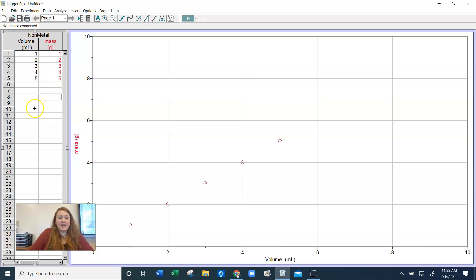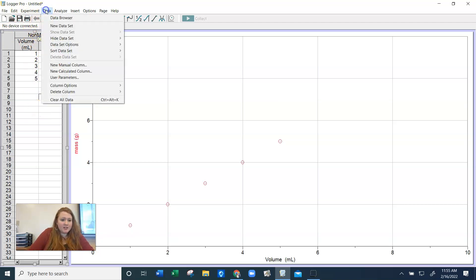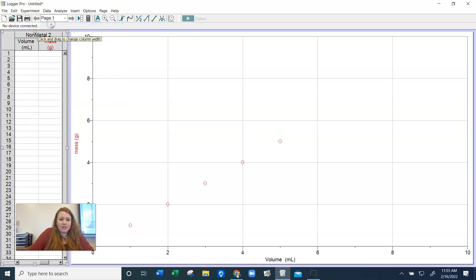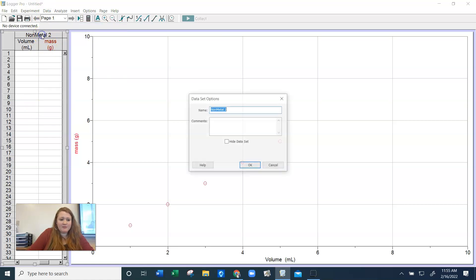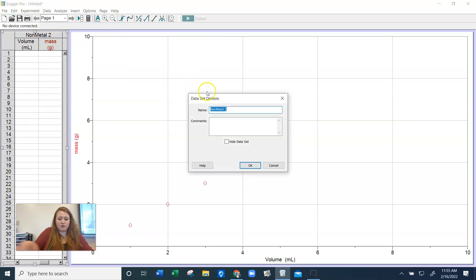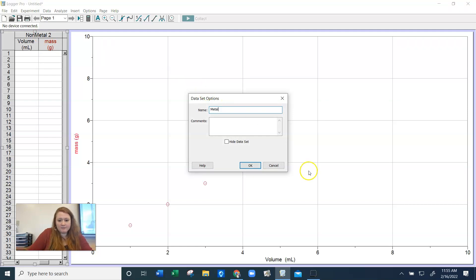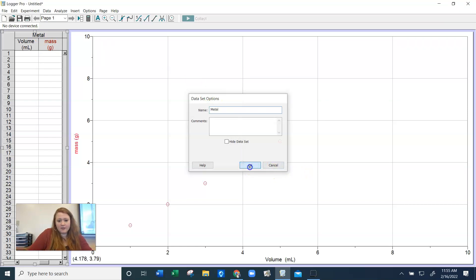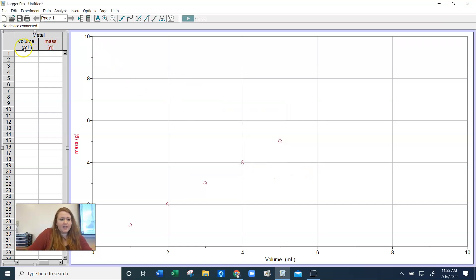Now we need to do the same thing for the metal. So we're going to go up here to data and we're going to make a new data set. The name of this data is going to be our metal. So you're going to double click it. And you'll see we already have volume and mass labeled here.